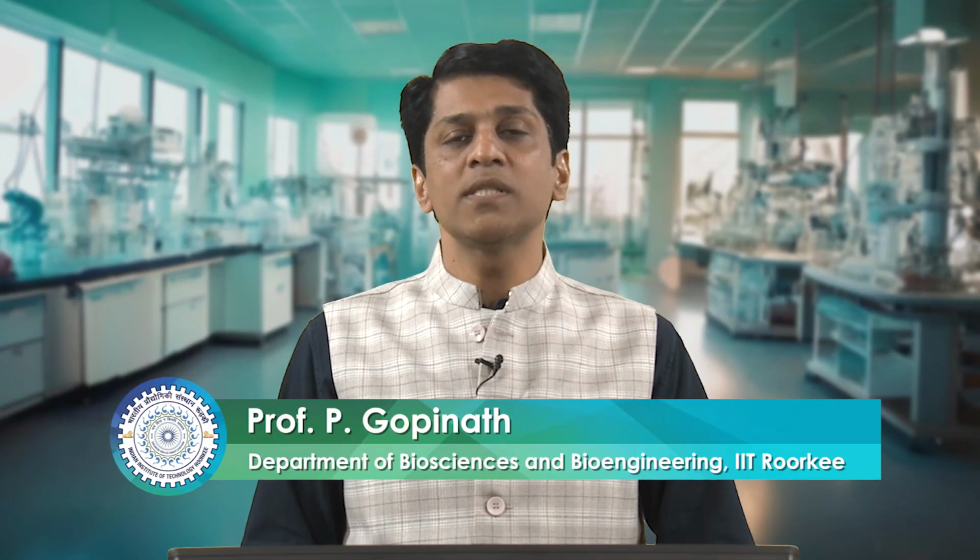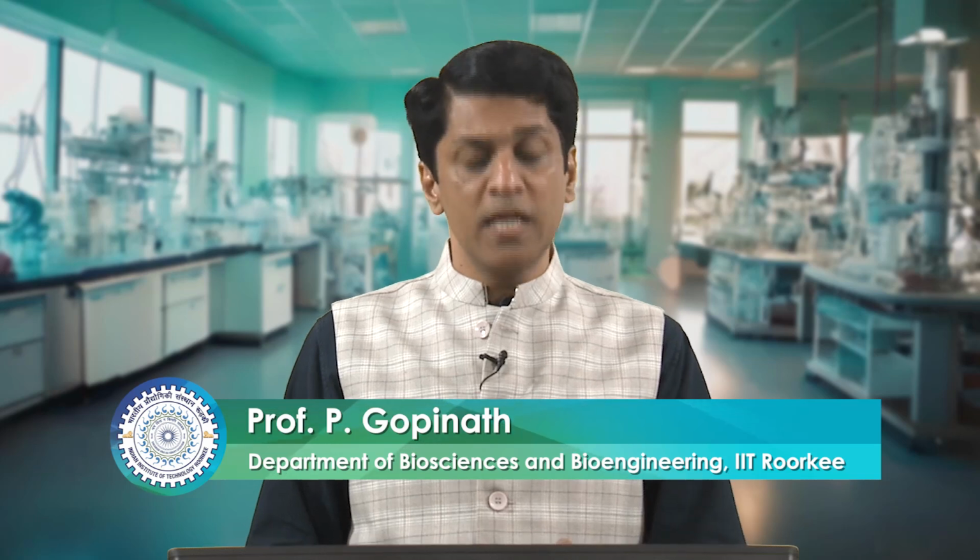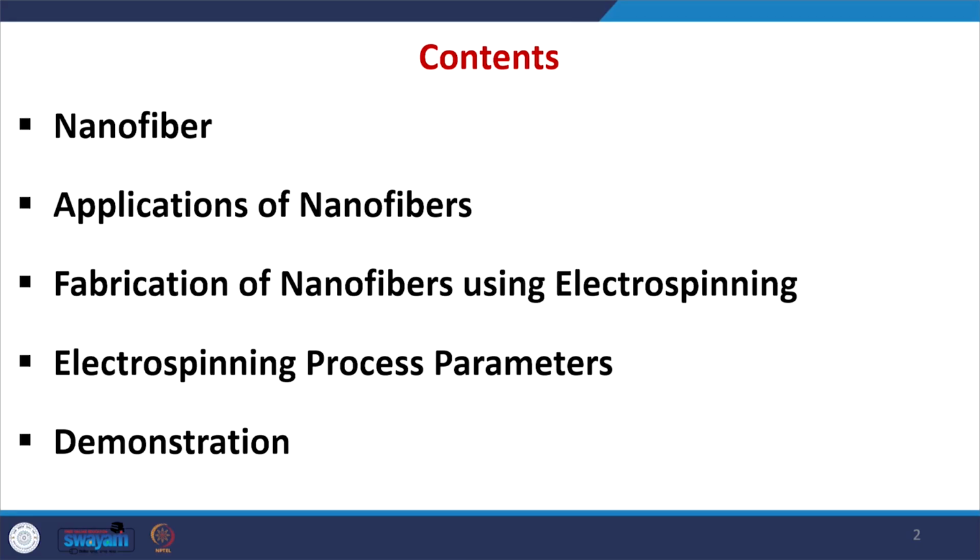Hello everyone. Today we are going to learn fabrication of nanofibers using electrospinning. In today's lecture, we are going to learn what is nanofiber, what are the applications of nanofibers, and how to fabricate nanofibers using electrospinning. And we are also going to learn what are the various parameters involved in this electrospinning process. At the end of this lecture, by practical demonstration, we will also learn this electrospinning technique in detail.